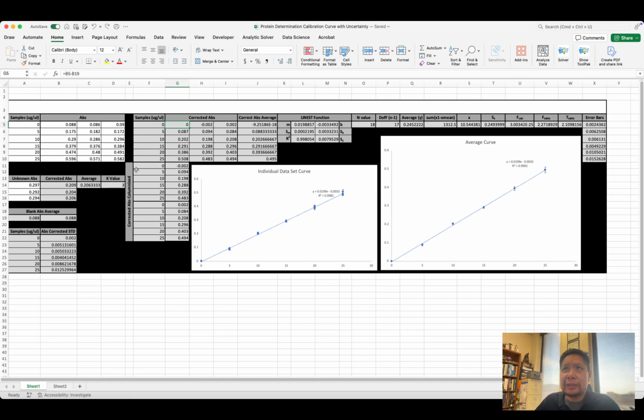Then you might be asking yourself, what is this down here? What are these below? So to do the calculations for all of the different statistical numbers and values, it's easier to do the calculation using an equation that has all your data columnized, like in a column, instead of going horizontally, right? It's easier for the equation to be in the vertical or column version instead of the horizontal or the row version, right? So this is what I call my columnized data, or columnized corrected values. And all they are is just referencing these up here, but in column form.